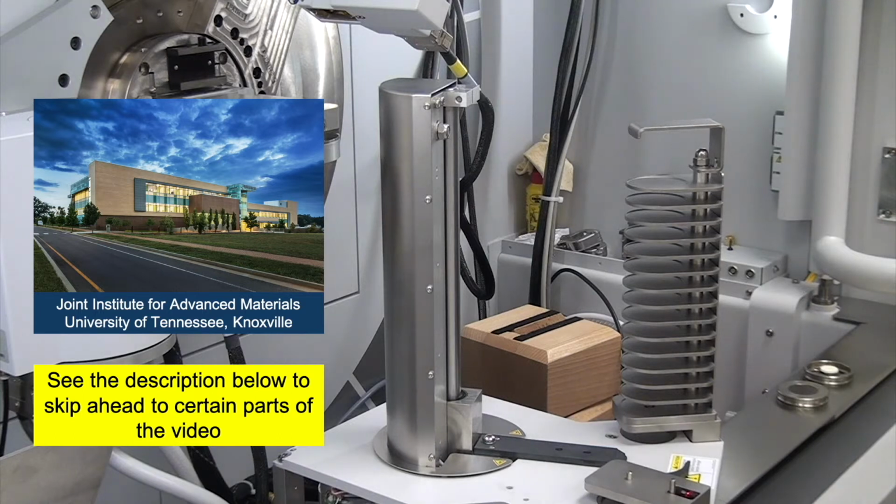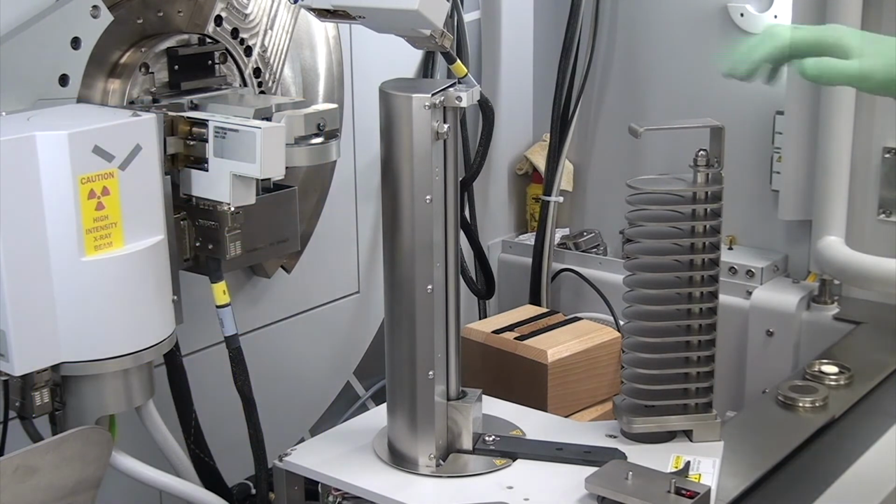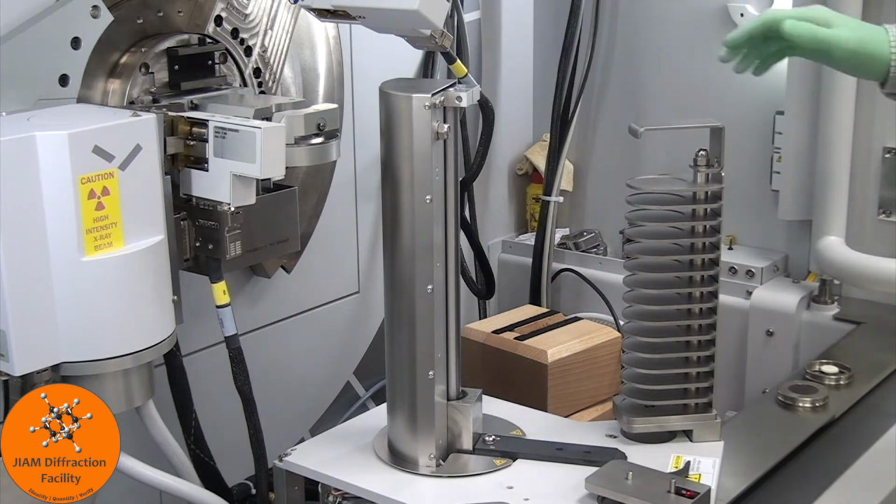In this video, I will show you how to use the automatic sample changer in an Empyrean diffractometer. Here we see the sample changer. It is very easy to use.